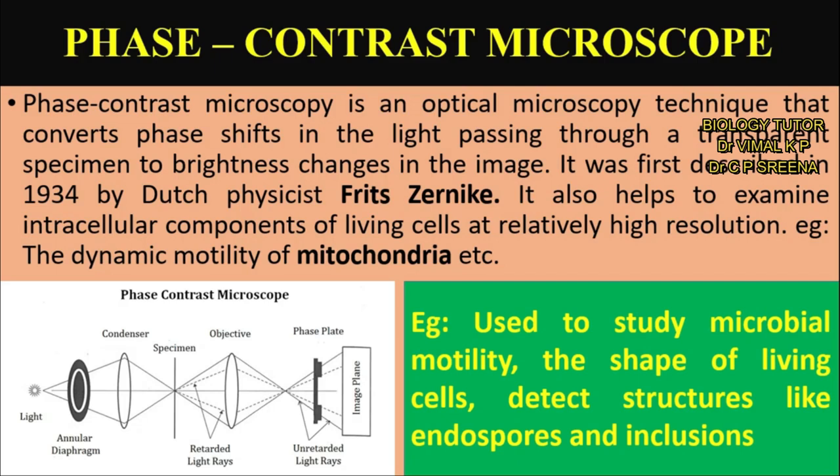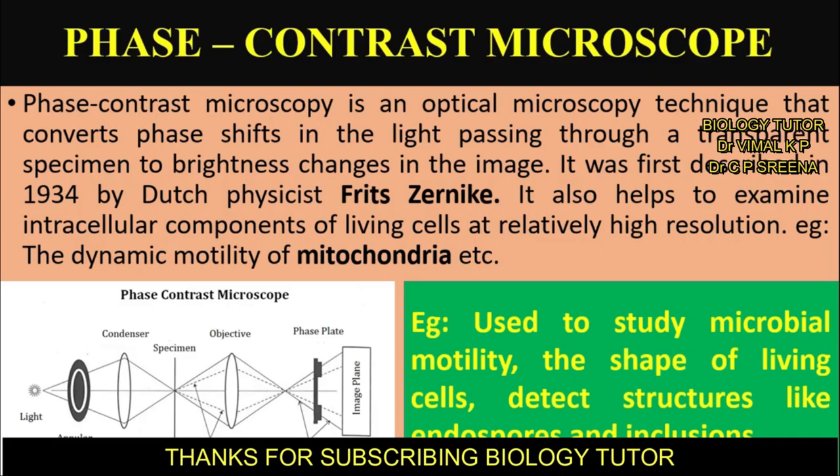It also helps to examine intracellular components of living cells at relatively high resolution. Example, the dynamic motility of mitochondria. It is also used to study microbial motility, the shape of living cells, and to detect structures like endospores and inclusion bodies.